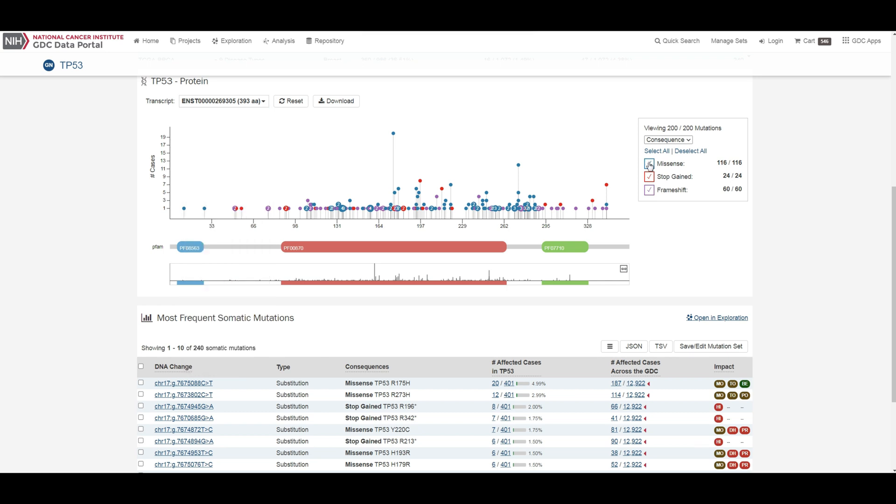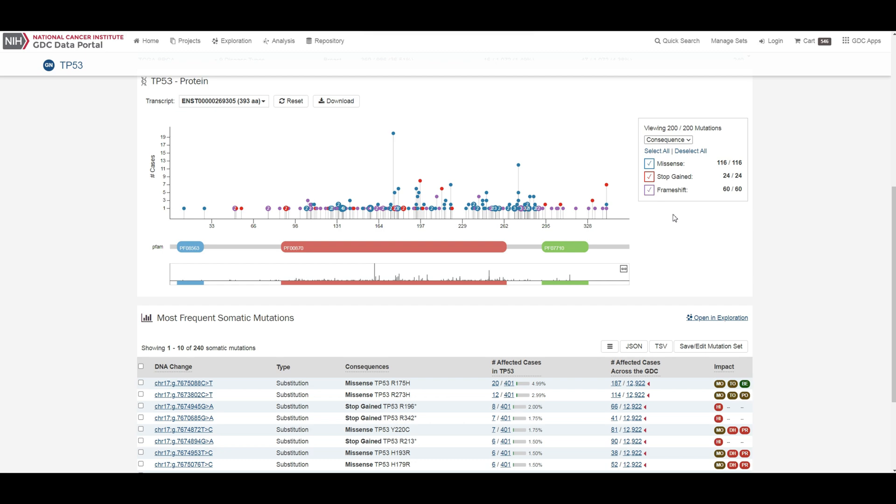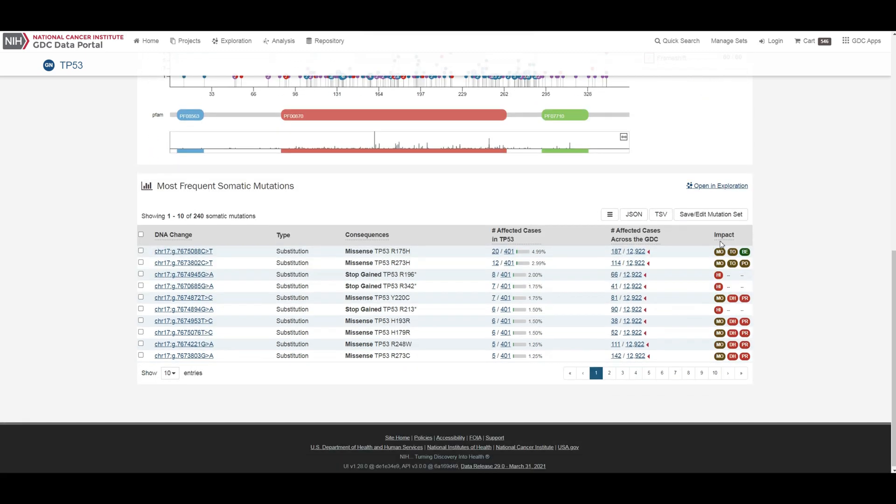The panel to the right of the plot allows the plot to be filtered by mutation consequences or impact. The plot will dynamically change as filters are applied. Mutation consequence and impact is denoted in the plot by color.